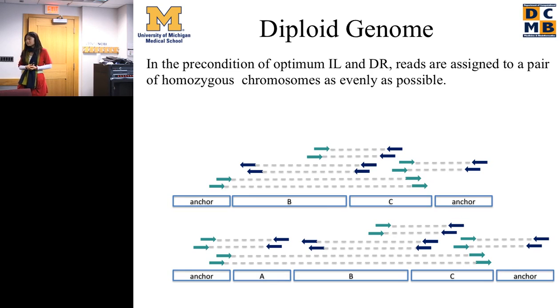So, there are going to be some reasons that no one's going to be able to apply this technology, just because you can't uniquely know where this group came from. For instance, this won't work with mobile elements, because they're too repetitive. You can't really know if what you're seeing is mapped correctly. However, this is expandable to larger insert libraries, such as mate pair or jumping libraries that are 3 KB, which do allow for amount of coverage to resolve some of these types of problems.